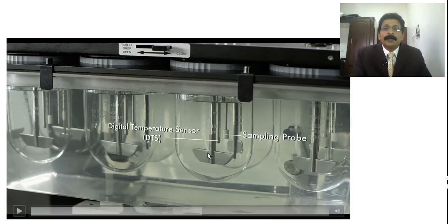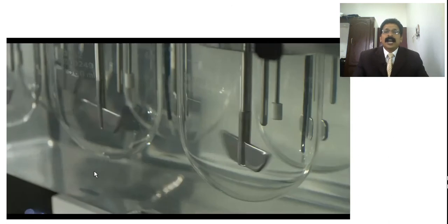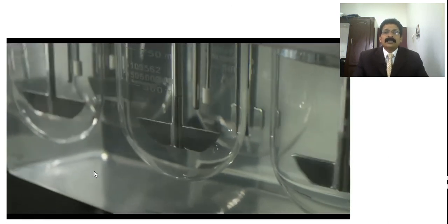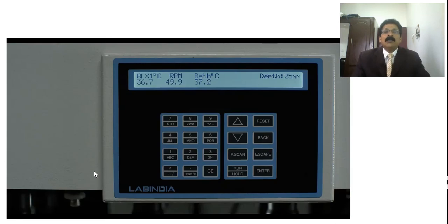Here the pedal, and here you can see the sample probe. It is clearly shown in the video, the sample probe, and this is the digital temperature sensor. See, pedal, sample probe, and digital temperature sensor is also there. So these all come inside the chamber, and you can see that all the pedals started working, and immediately now it will give the information.